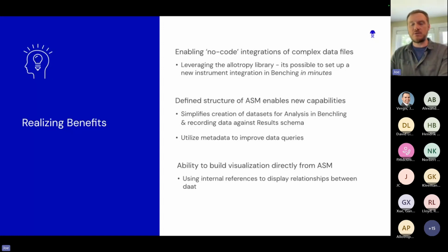The other thing is that the defined structures are really helping us start to bring this data into other aspects of our product that are more user facing. So it's simplifying the ability to create data sets for our analysis tools, and it's also going to help us write better queries into the data that's stored in Benchling.